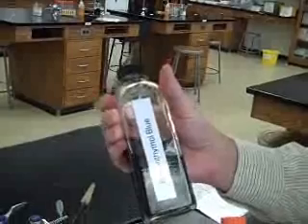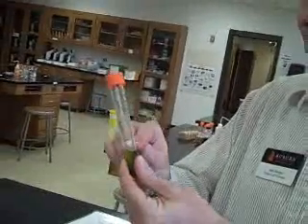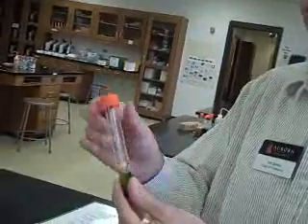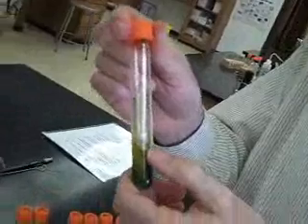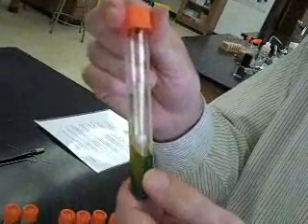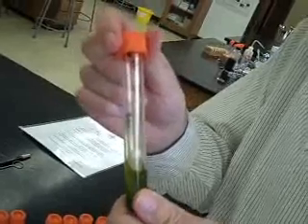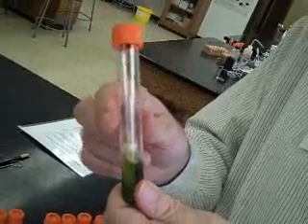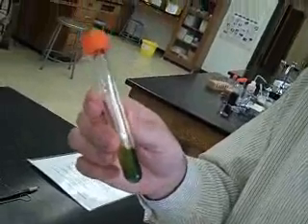What makes it acidic if there's aerobic cellular respiration is the fact that carbon dioxide gas is released. When carbon dioxide gas is released inside this tube, it will dissolve inside the bromothymol blue, forming carbonic acid, and it lowers the pH, and therefore it makes the bromothymol blue change color and become yellow. So if you see a yellow color in the tube, it means there is aerobic cellular respiration occurring. If it stays green, it means there's not.